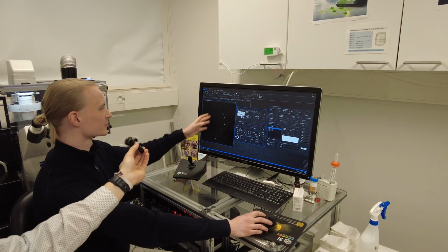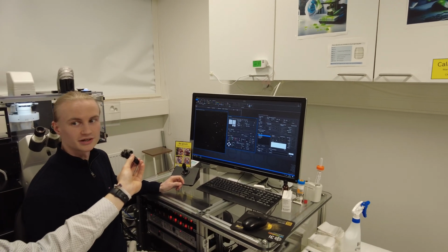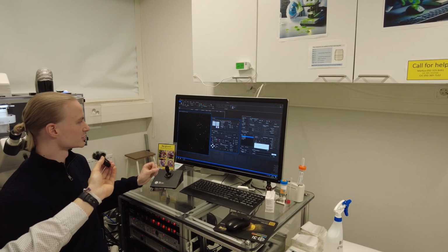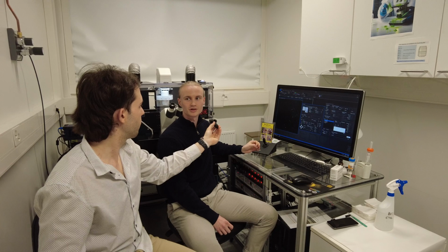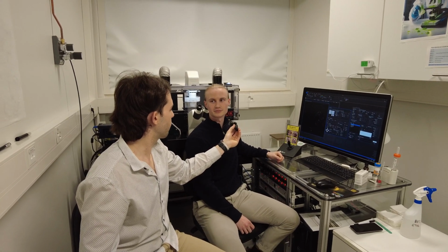And here, for example, we have this one protein that we're very much interested in our lab, which is labeling this intracellular small structure called the chromatoid body, which is a ribonucleoprotein granule, the function of which we're trying to understand, and the importance of that for spermatogenesis.